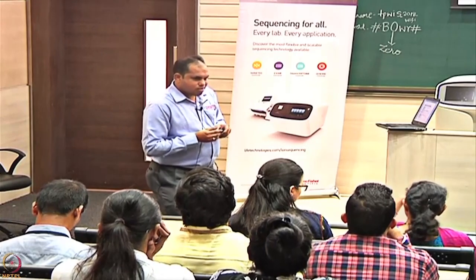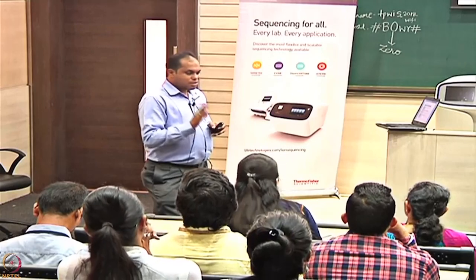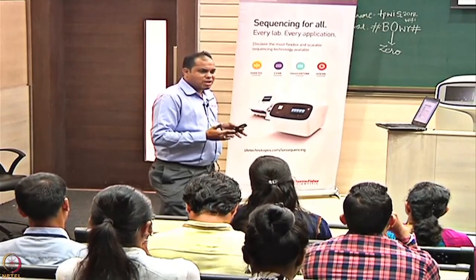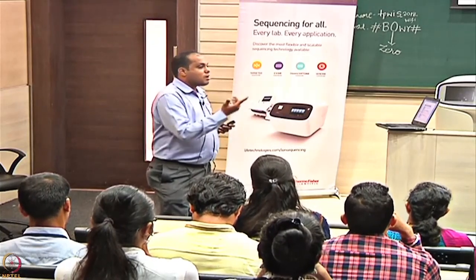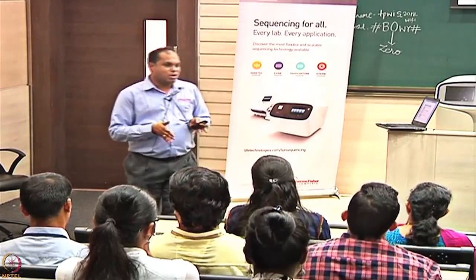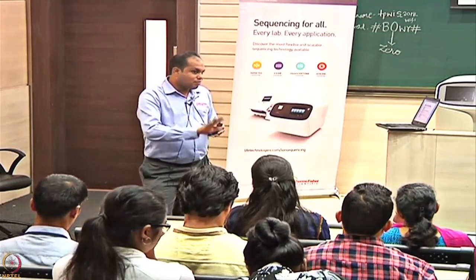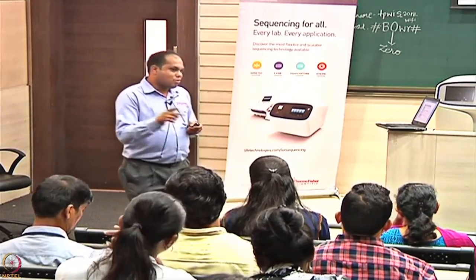Okay. So has this been integrated? This has been done. These are the approvals that they have got through the US FDA. Whatever drug information we are giving is based on the approvals that are available, like the US FDA or the European, I don't get that name, ESMO. So they have utilized the same information over here to summarize and give it. How to represent it is all about the person who is going to use the NGS system. They plan how to give it as a format or as an approval. So they try to work on that and then give it.